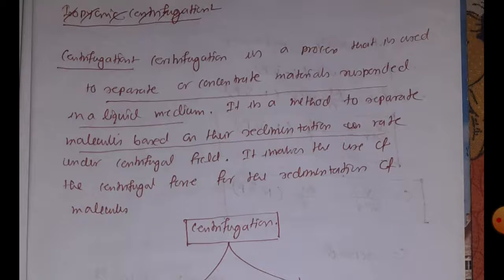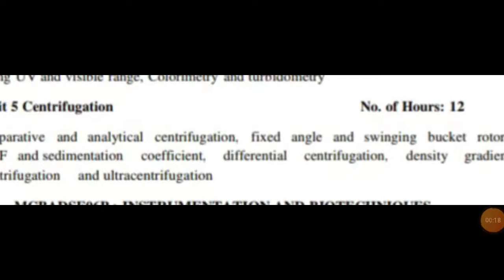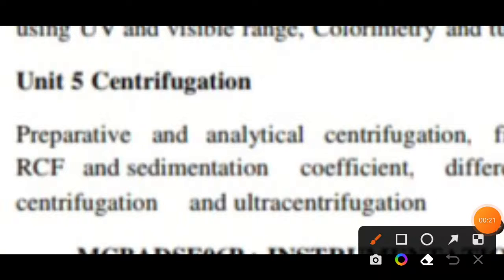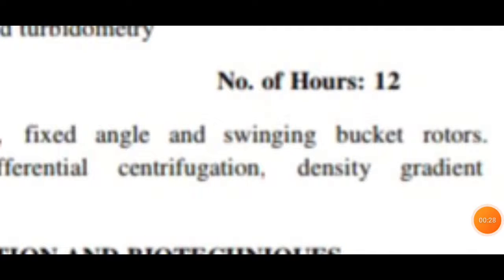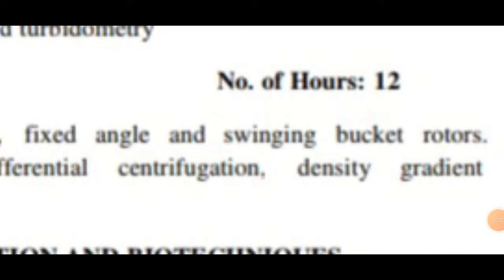So today we are going to take a very exciting series where we are going to discuss the centrifugation chapter. Okay, so these topics are our topic of discussion. First of all, we are going to discuss preparative and analytical centrifugation. Then a new topic that we have not discussed previously, that is fixed angle and swinging bucket rotor.